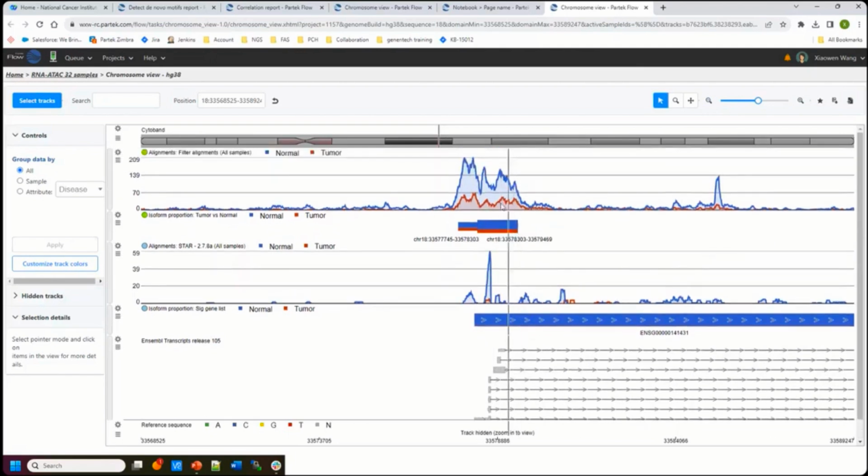And on the top is my ATAC-seq data. I can clearly see the normal is high and the tumor is low. And this is in the promoter region, right? So suppose that this is the transcription site. Some is from here, some is from here, but up and down 1,000 base pairs is probably your promoter region. So this is kind of related. This is another way for you to present your result for this particular gene. All right.